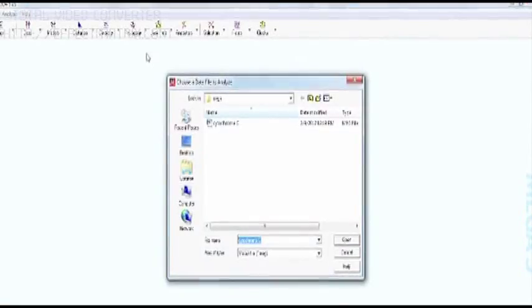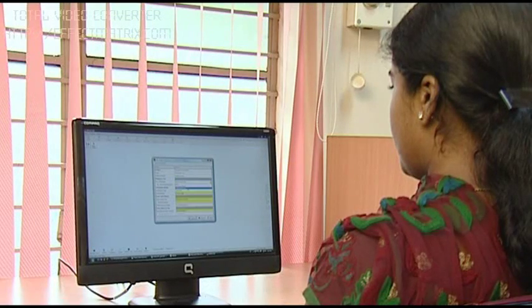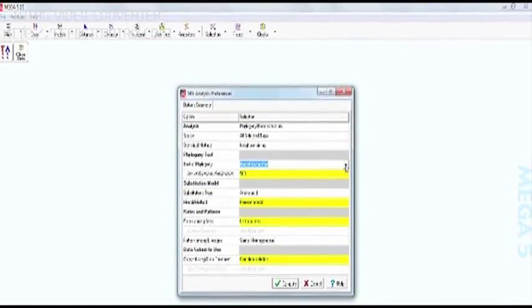Open MEGA tool by double-clicking on the MEGA tool icon. From the main MEGA launch bar, select Phylogeny, Construct or Test Neighbor Joining Tree menu option. A select window will appear on the screen. Now, you need to load the alignment file, locate your alignment file and click Open.